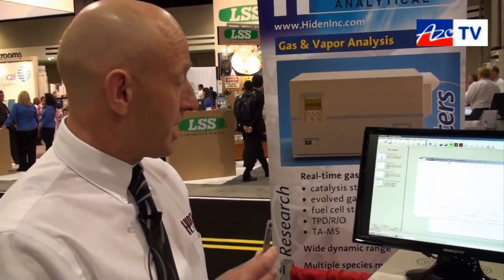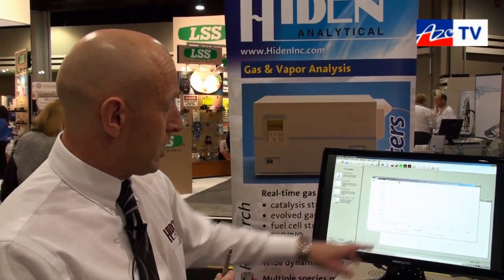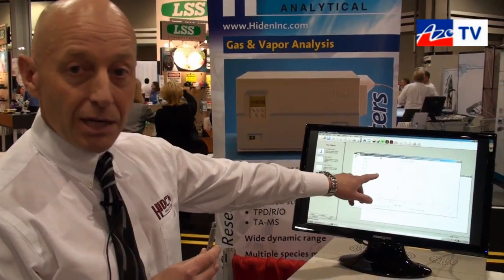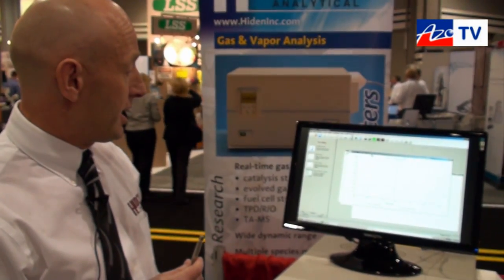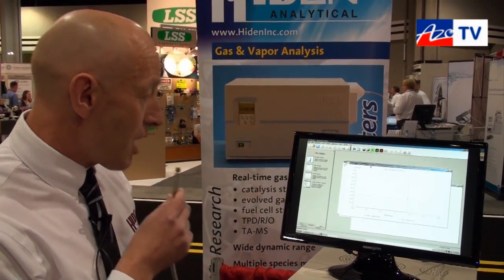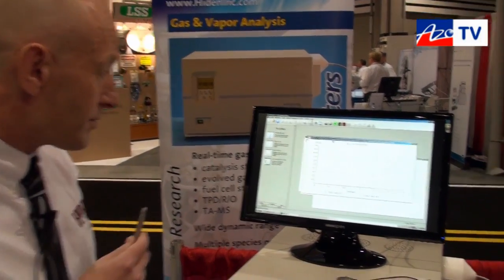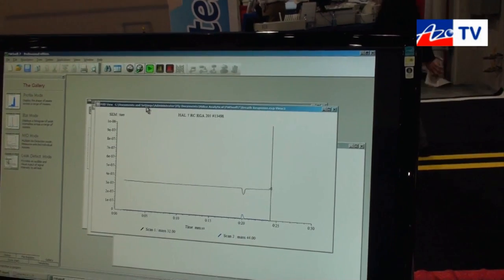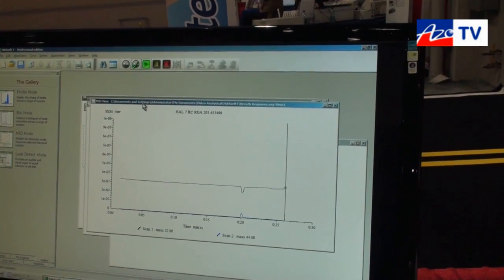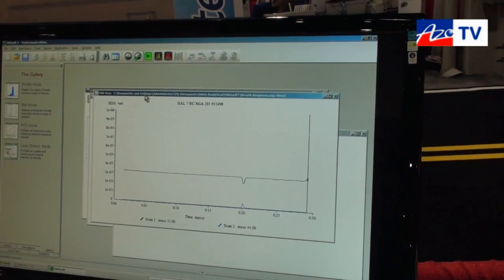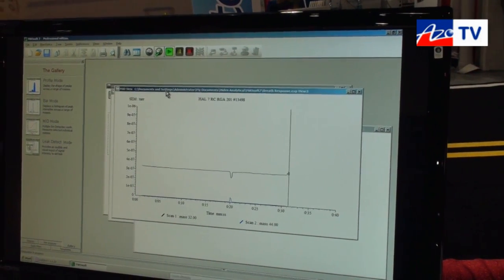I'm just going to breathe into the capillary here. What you need to be looking for on the screen is both the rise time and the fall time as I exhale CO2 and you see the depletion of the oxygen. You can see the response is extremely fast — for this particular unit we have a response time of around 300 milliseconds.